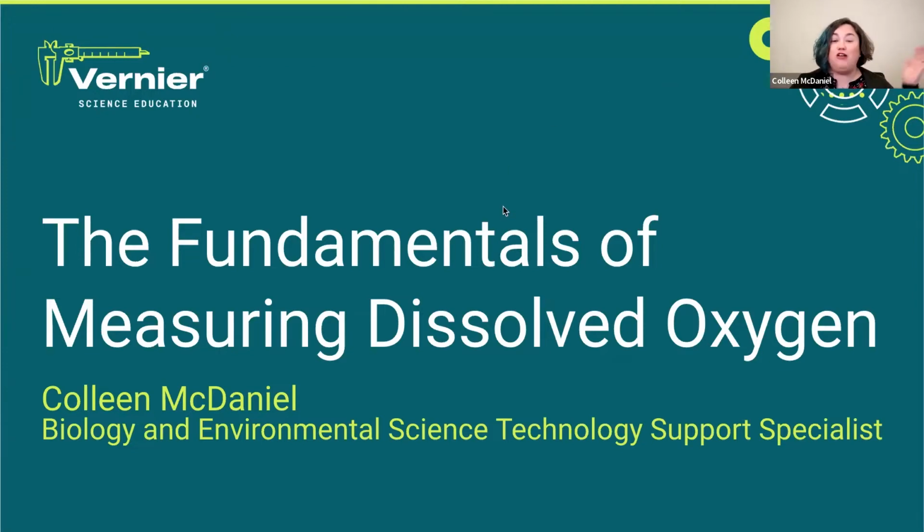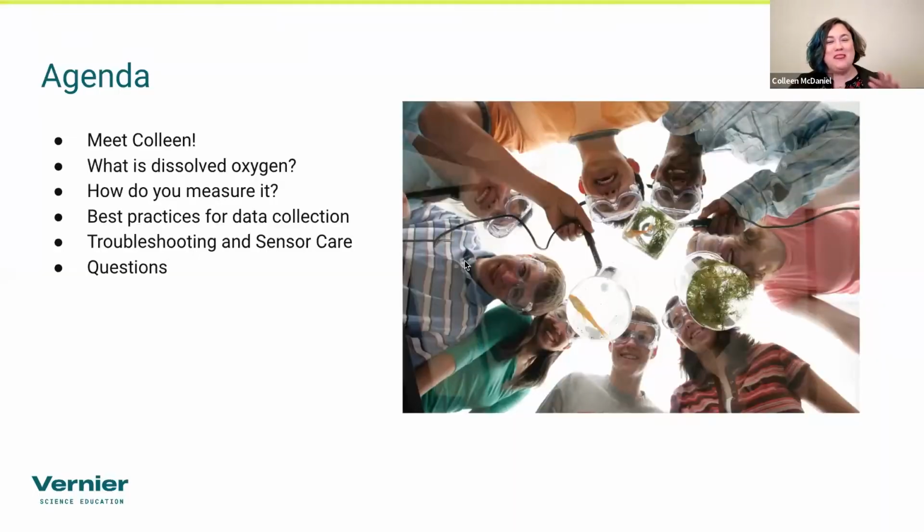So today, a pretty simple agenda. I'll introduce myself. We're going to talk about what exactly dissolved oxygen is, different methods we can use to collect it, and best practices for data collection. I'm also going to definitely cover some troubleshooting and sensor care that I seem to get a lot of questions about in tech support, and any other general questions you might have about using dissolved oxygen probes or measuring dissolved oxygen.